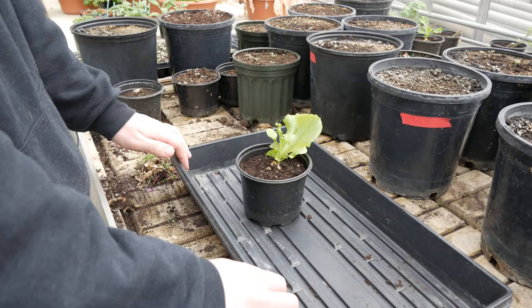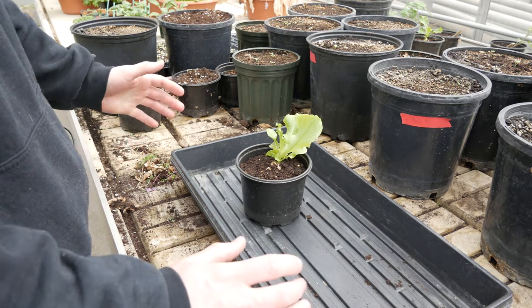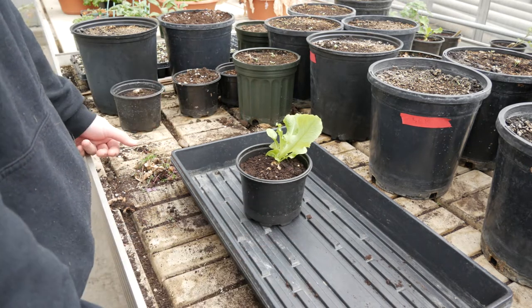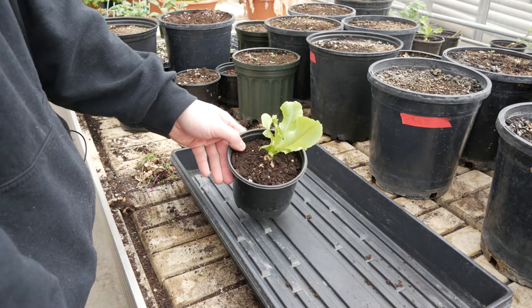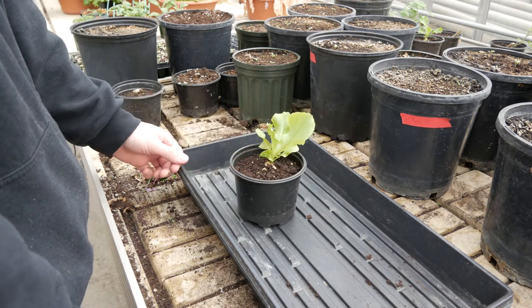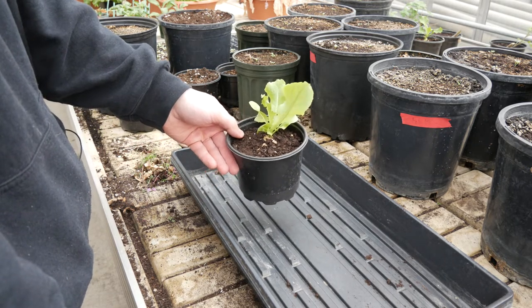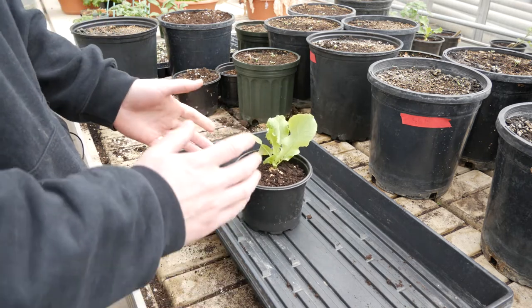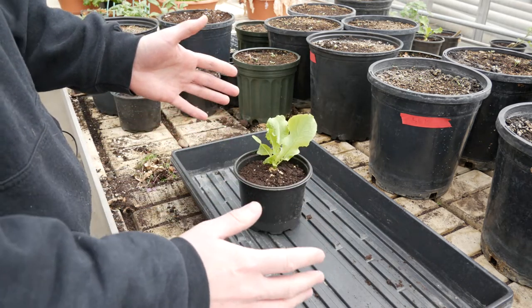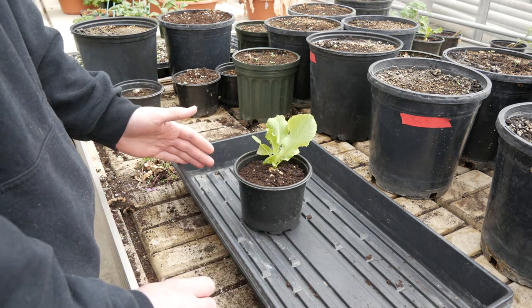We're building up a root knot nematode culture here in our greenhouse on one of our dedicated benches. We've planted lettuce and susceptible tomato in soil that's naturally infested with root knot nematodes. First, we want to find if there's galling on any of these roots, since sometimes there's better galling on certain pots than others, so we want to check that before starting the egg extraction process.